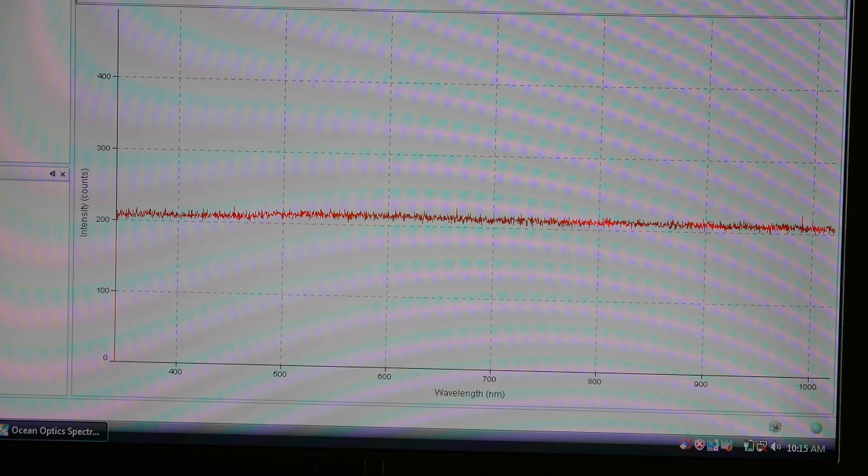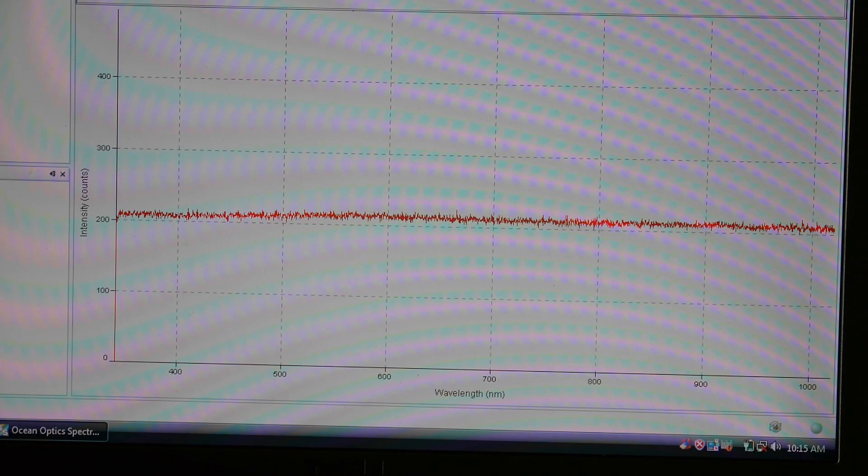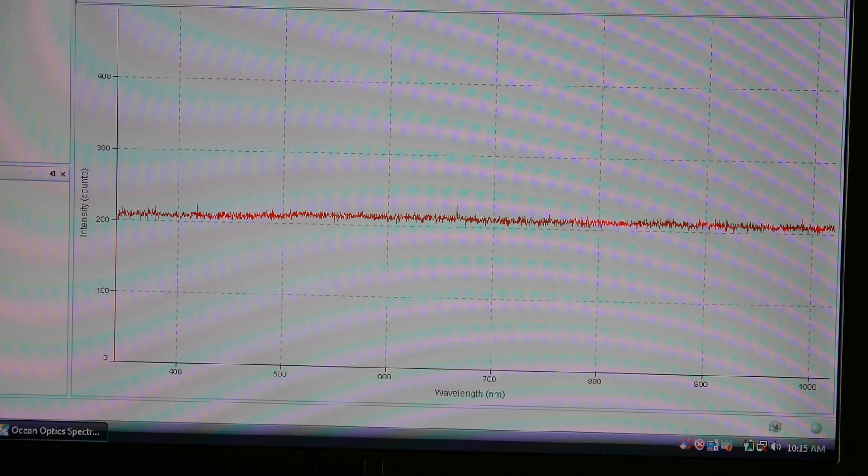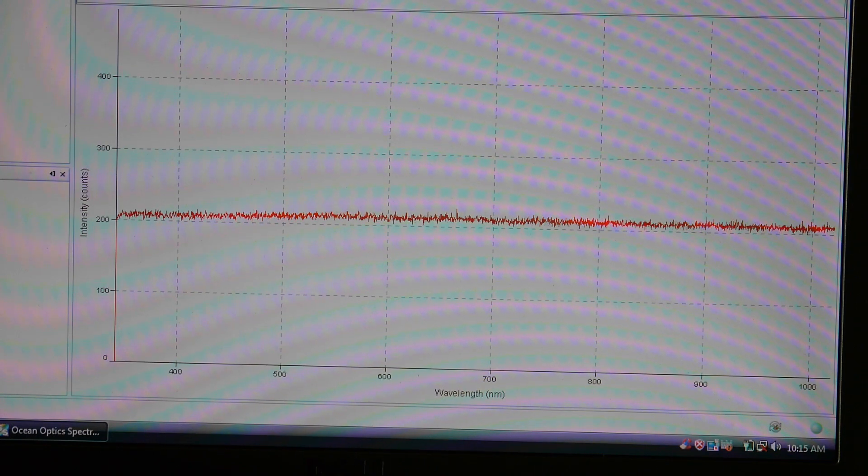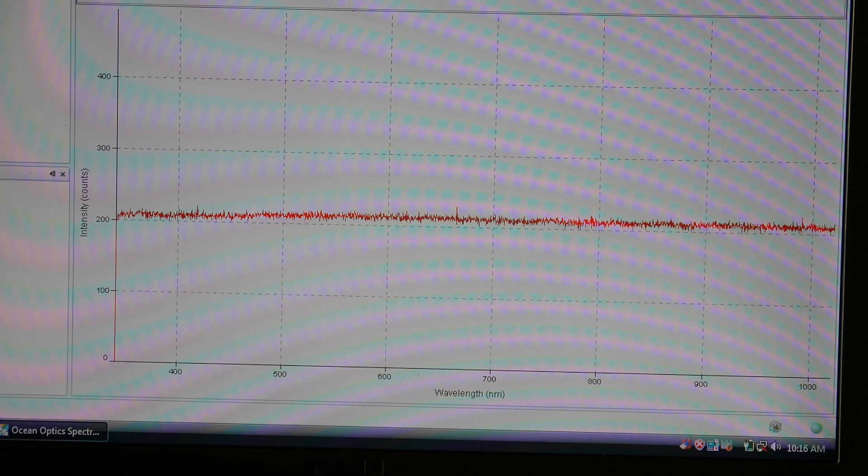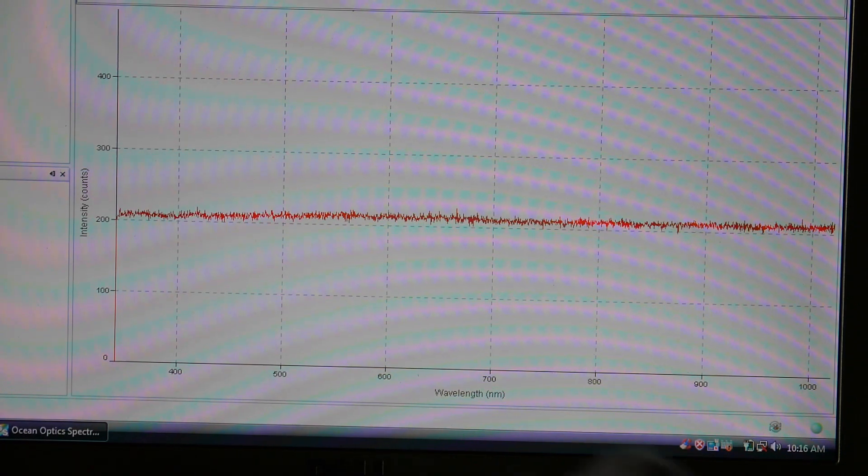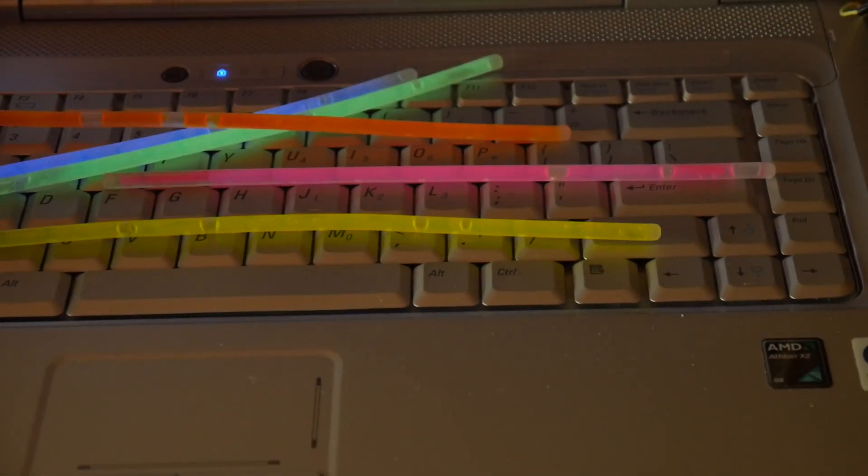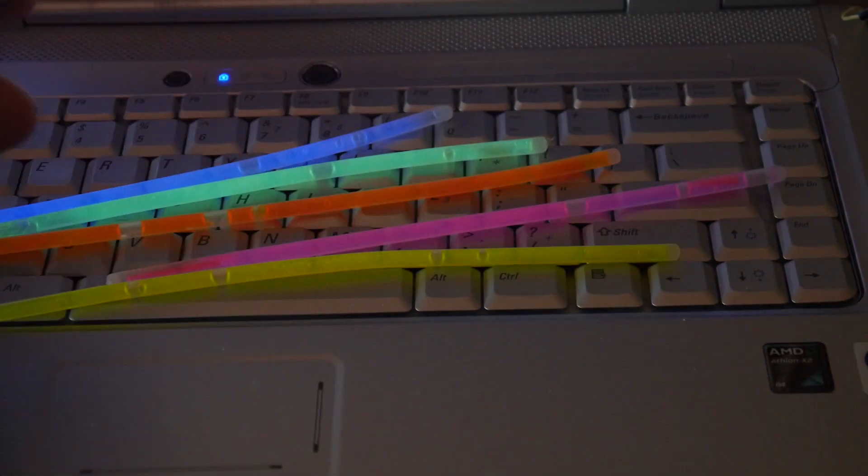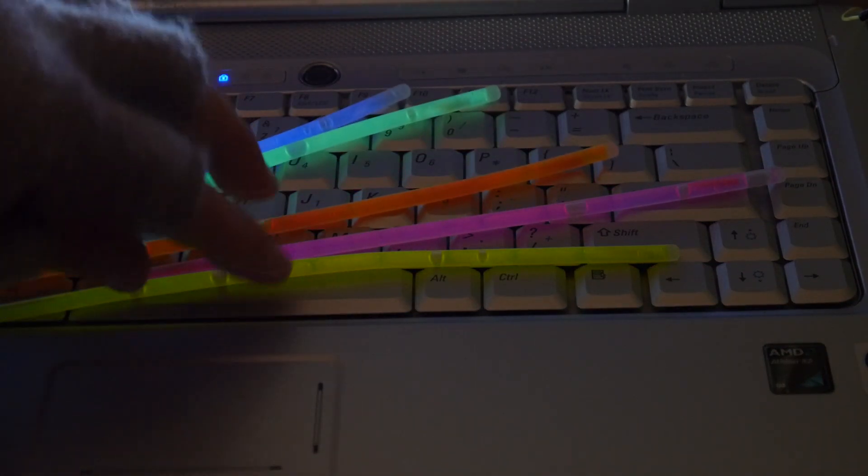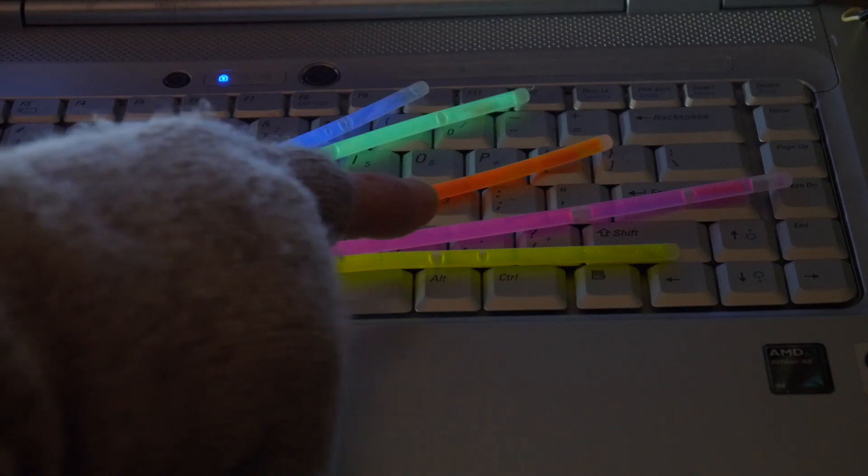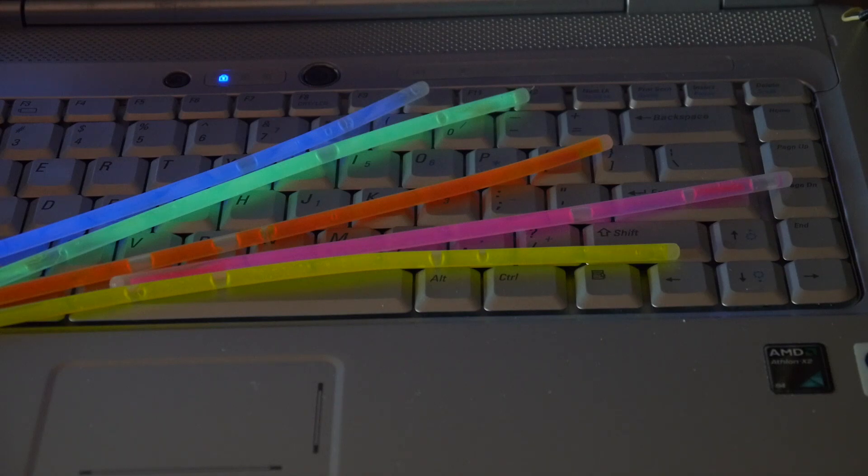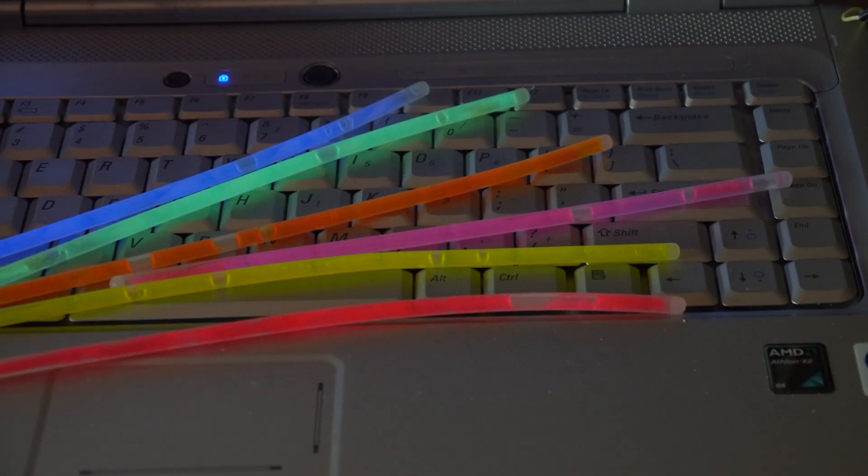And do I have any others? Let's see, that one's blue, that one's red, that one's... I think those are the only ones I've got. Yep, I think that's my selection. So here's all of our colors. And we had a red one, orange. Let's see, what would we have here? Oh we should have a red one somewhere. Let's see if we can find a red one. We have an orange one, a purple one, a yellow one, a green one, and a blue one. There's got to be a red one here somewhere. Let me crack this one open and see what color is. Yeah, so there we go. There's a red one. So let's take a look at red. That'll be all of the colors I've got.